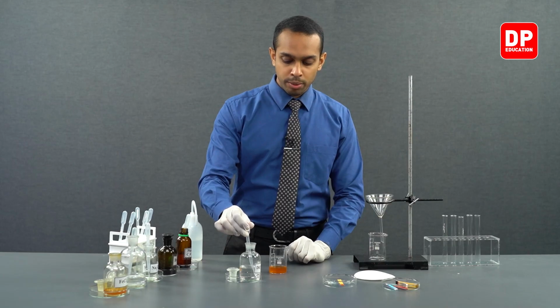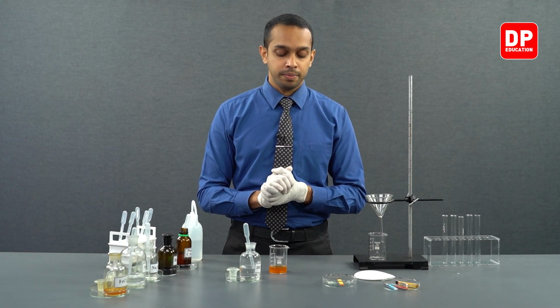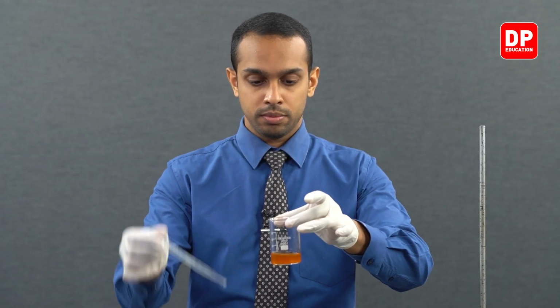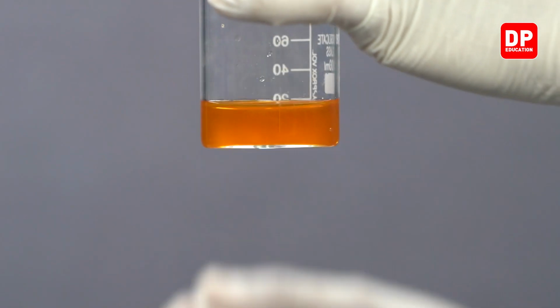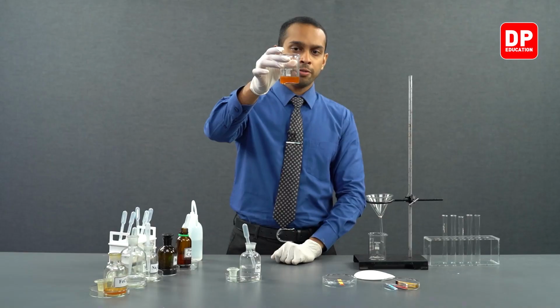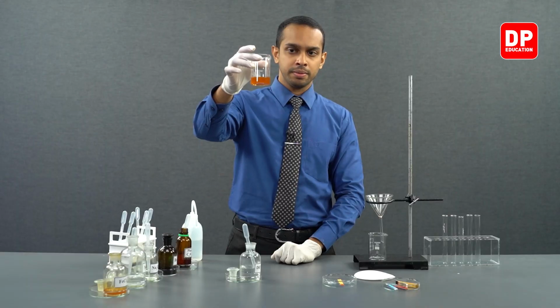We will add dilute ammonia drop by drop until we observe a brown color precipitate. When you add ammonium hydroxide, you can see, before mixing it, the formation of a brown color precipitate. But if you mix it, you might see it disappearing.